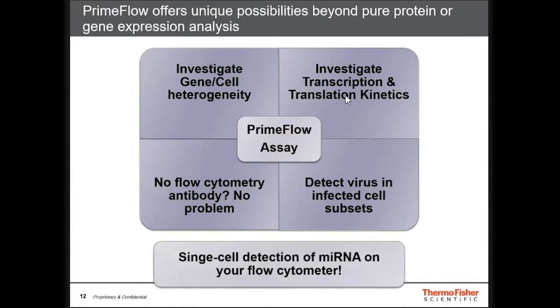And finally, I won't show any data for this here, but it is also possible to use the assay for microRNAs too. We have a slightly modified version of the assay, use the normal kit, and then we just have an additional fixation buffer you can include if you want to look at those instead of just normal mRNA.